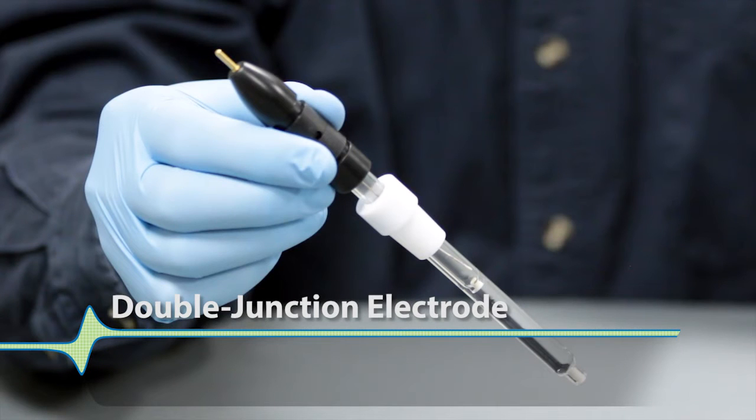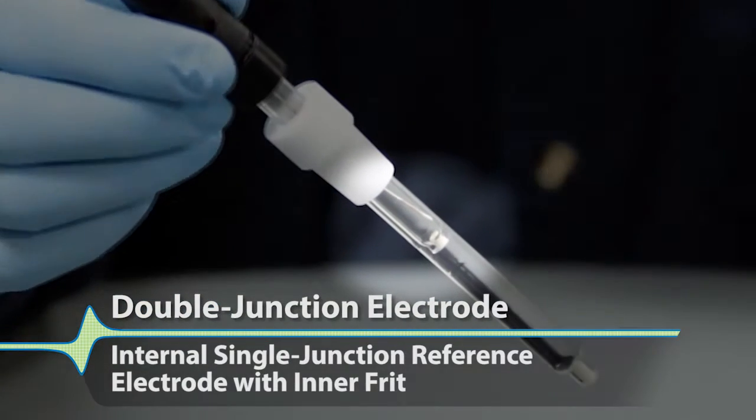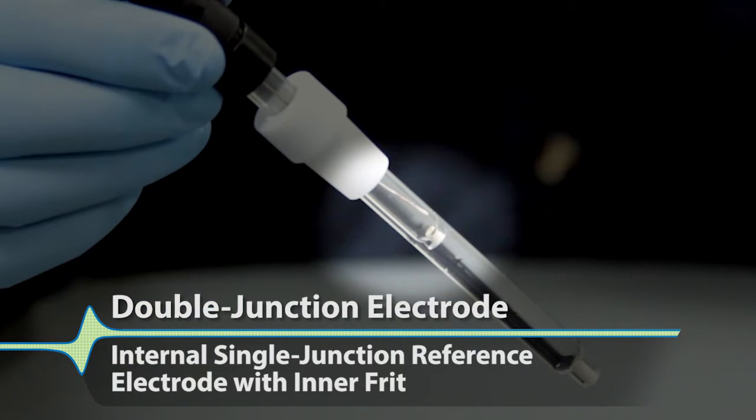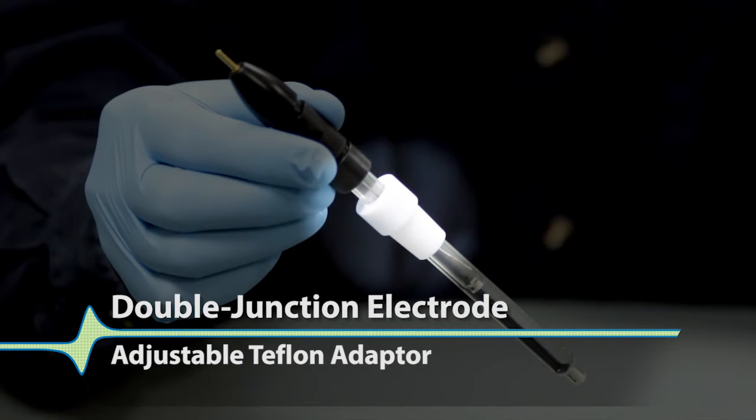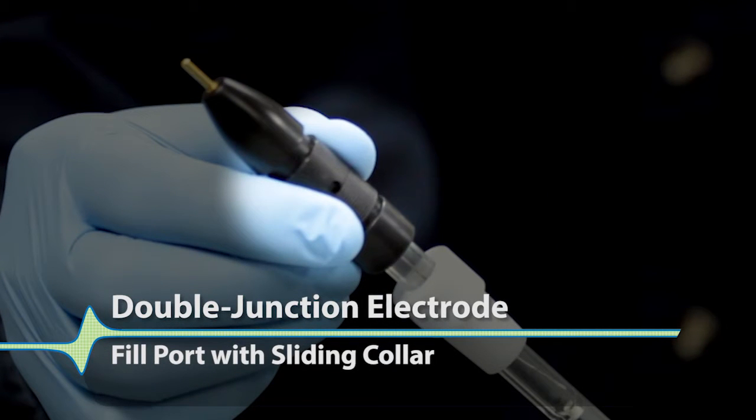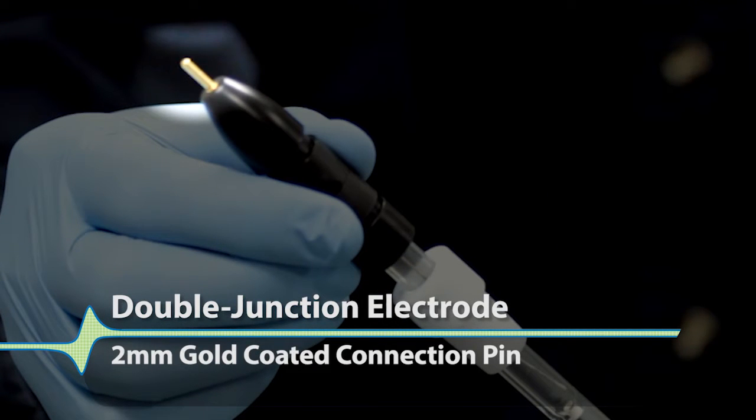If you're using a double junction electrode, you will have a small internal single junction reference electrode with an inner frit, an outer 9.5 millimeter glass body fritted tube, an adjustable Teflon adapter, a fill port with a sliding collar, and a 2 millimeter diameter gold-coated connection pin.